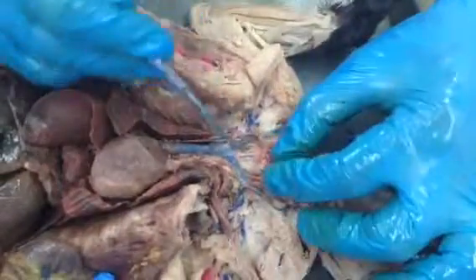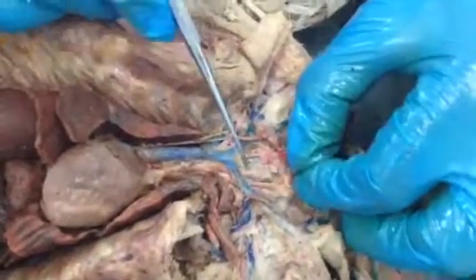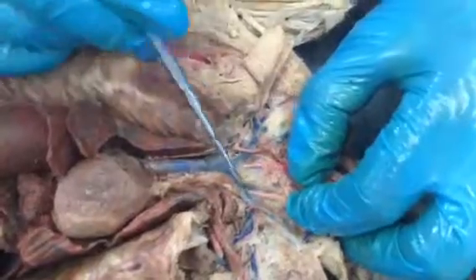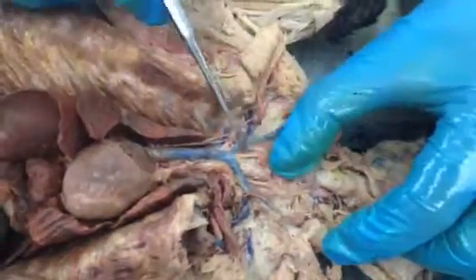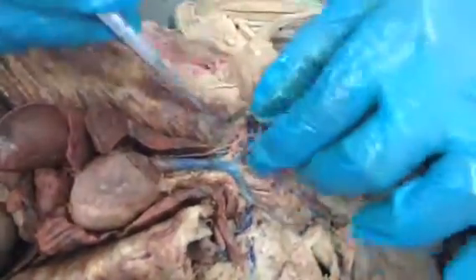And there is a 3rd vessel, but usually it is not injected in most of the... Oh, there it is. That's not it. There is a 3rd vessel that forms the brachiocephalic called the internal jugular. It's not on this particular cat.